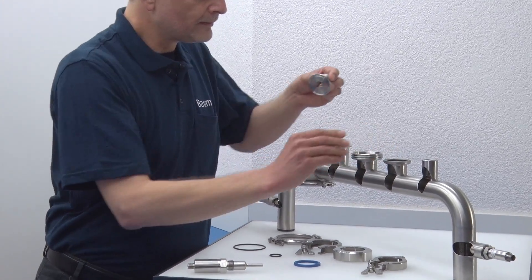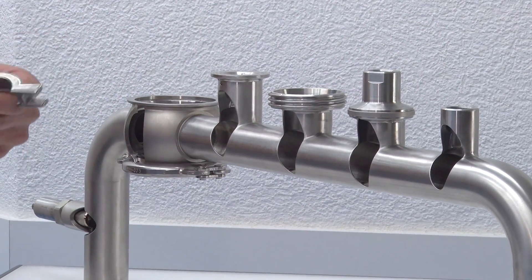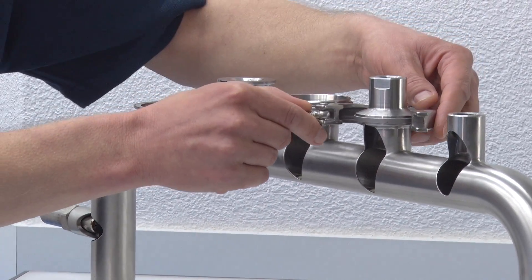Simply mount the adapter, secure by ferrule, and you end up with a clamp connection.